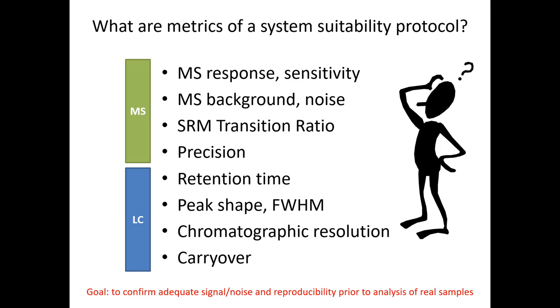And helium is much smaller than argon, and I wasn't getting any MS2 spectra. I was loading my sample, I was seeing like these little blips in my gradient, like, what the heck is going on? So I went back to my system suitability and I ran that, and it was not performing, and I tracked it back to what was the last thing I did after a good system suitability, and it was, oh, I ran out of argon, so I changed the tank.